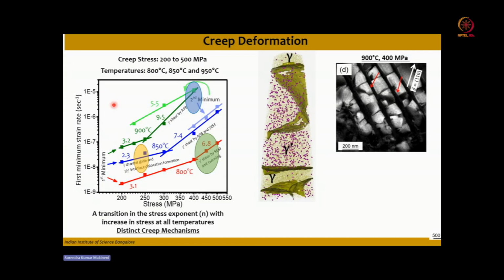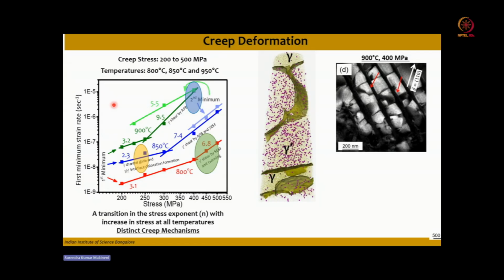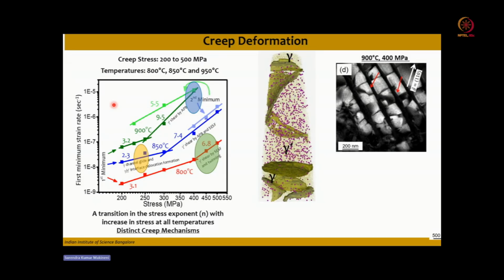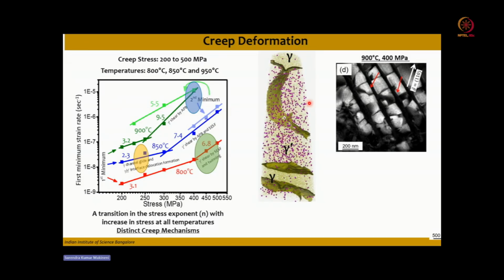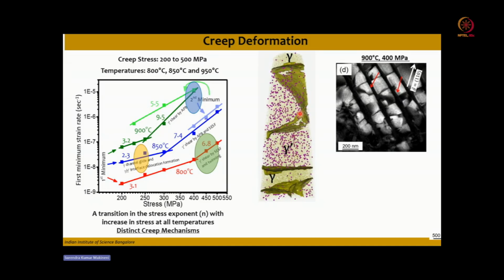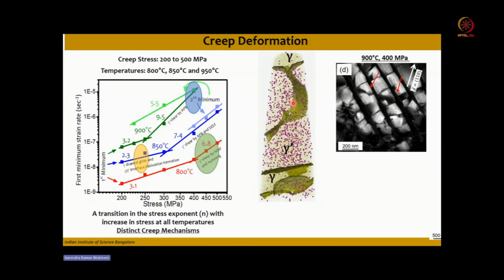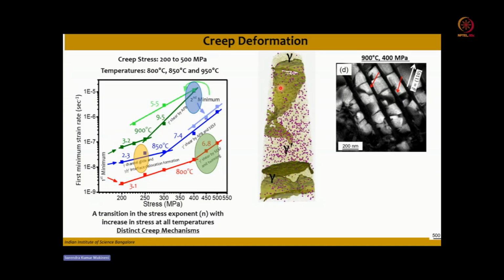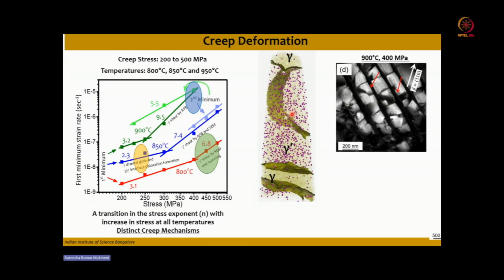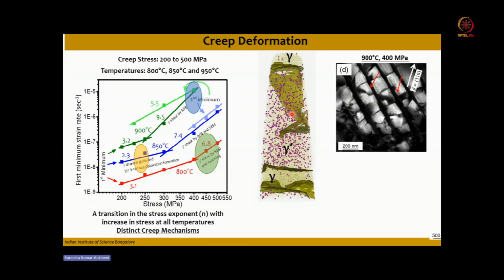If you see the atom probe map, clearly, as expected, there is a curvature inside the gamma prime precipitates. You can see that the cobalt isosurface shows that these antiphase boundaries are curved in nature, meaning they are actually the transition from the 111 to the 100 plane.